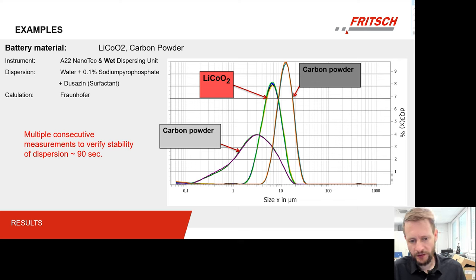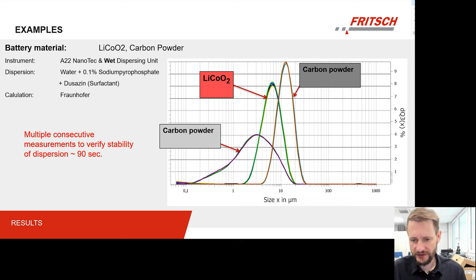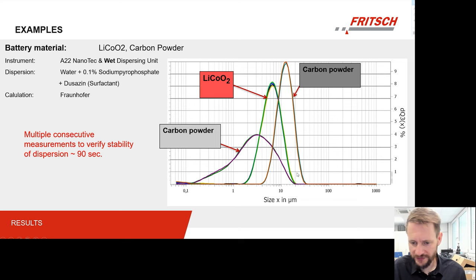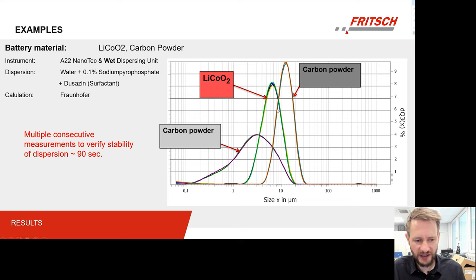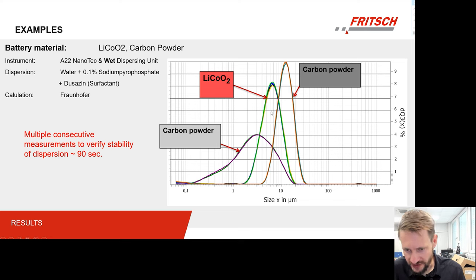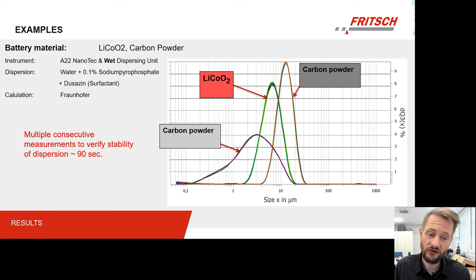The main thing you see is that in each case we performed multiple measurements to have information about the stability of our dispersion. In each case we see that the consecutive measurements are more or less identical — there is no shift in a certain direction which would indicate that our dispersion is not stable or that something with our particle size is still changing. We see that it is stable and thus that we can rely on these results. Each of these samples were probably measured with three to five consecutive measurements within maybe one and a half or two minutes, and then you have the result. So you can see it is really, really quick.